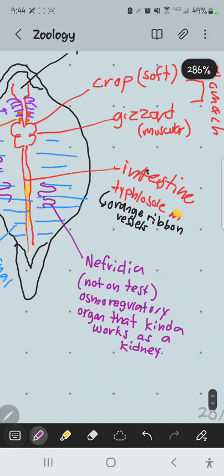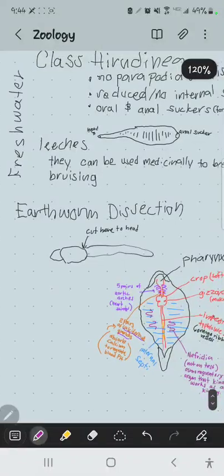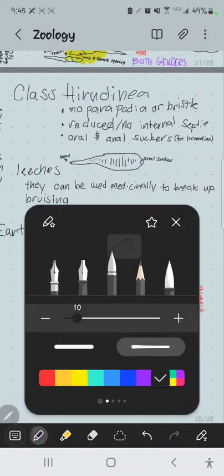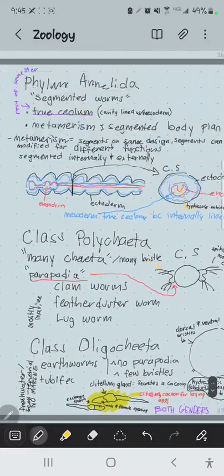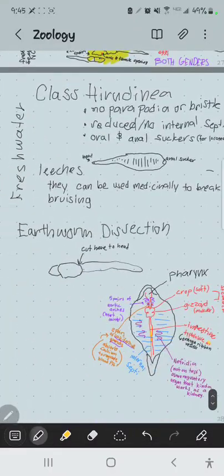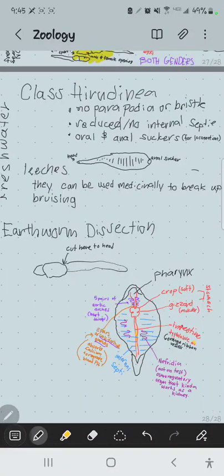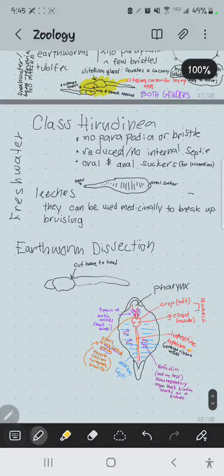I'm only drawing them in a few segments here, but they basically occur in every segment of the body as pairs of nephridia. And in fact, in the cross section, sometimes you can see a little remnant of a loop like this, and that would be the nephridia that you see in the section. But see if you can find those. I won't ask them on a test because they're hard to identify during a 1 hour exam. But I think they're really cool, and they're kind of transparent. They look almost like a little clear hairpin. But you can usually see them right where you initiate your cut.